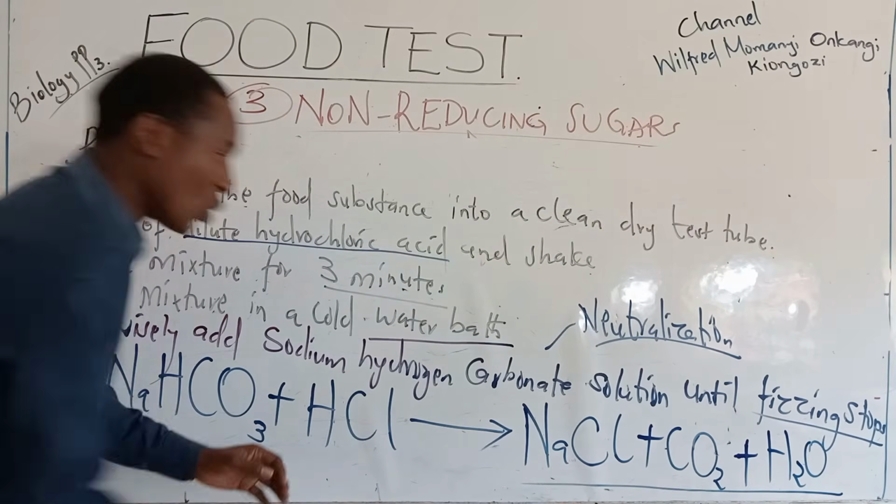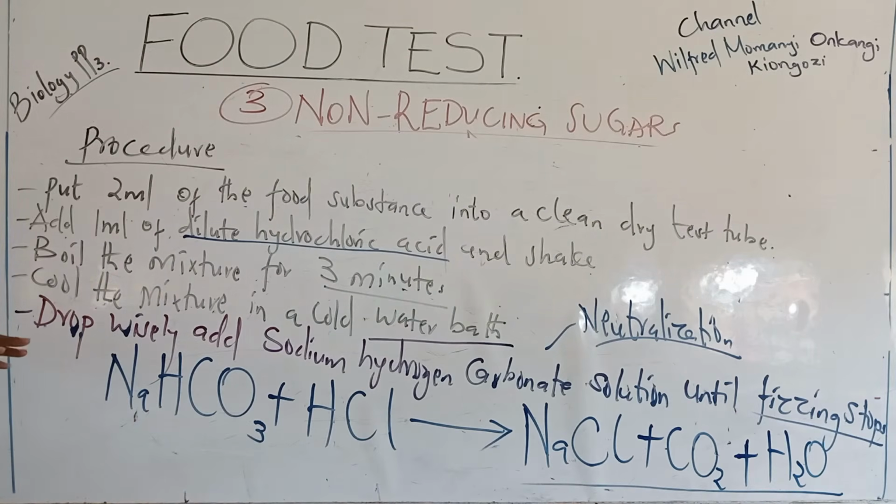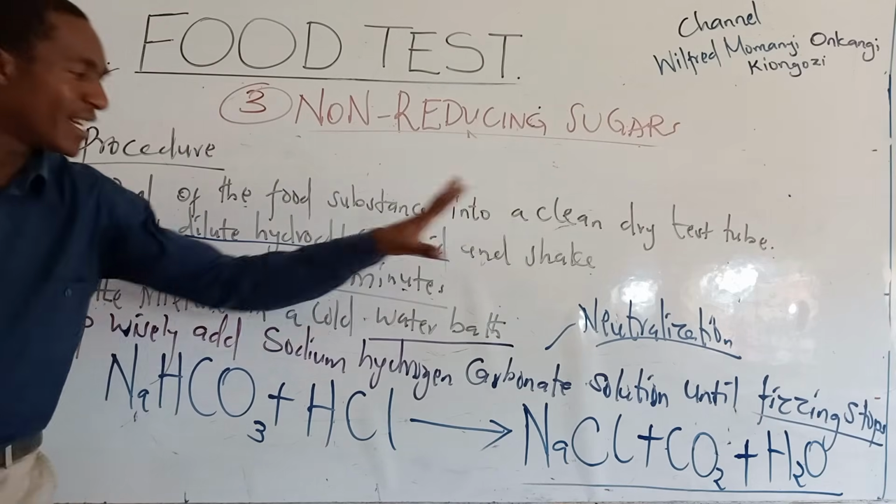It is a balanced chemical equation. So you make sure that the acid is completely neutralized.